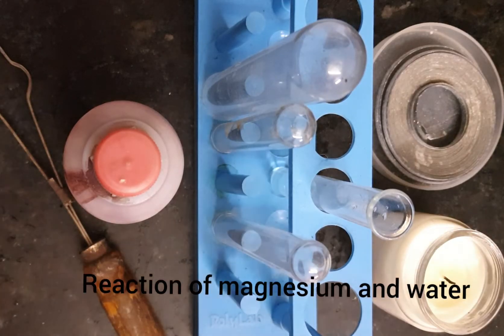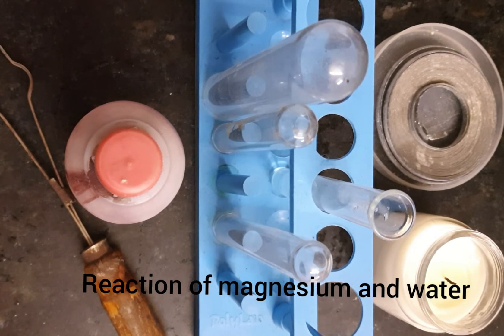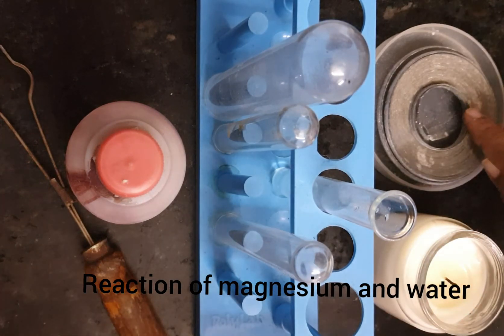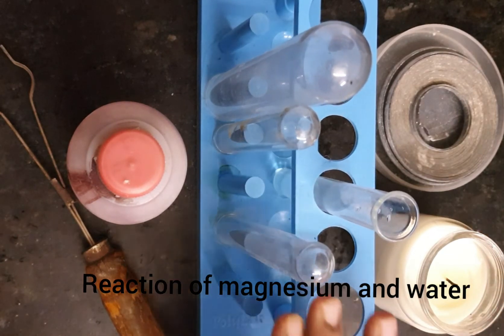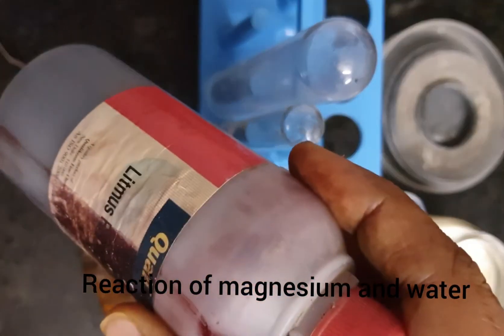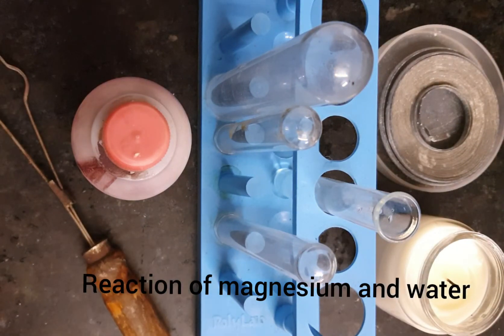Hello students, I am back with another interesting activity again with the magnesium ribbon. We will see the reaction between the magnesium ribbon and water. To start with this reaction, we require magnesium ribbon, a candle because we want to warm up the water, the test tube stand, test tubes, red litmus, and a test tube holder.